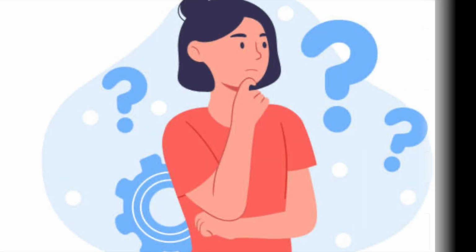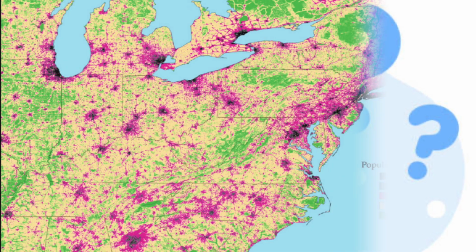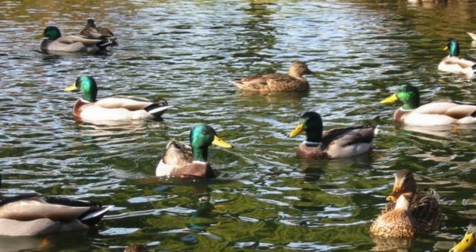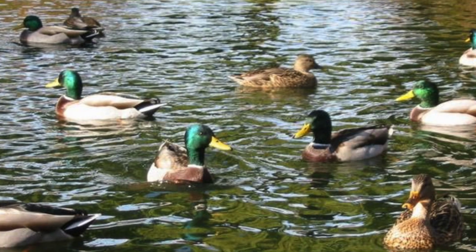The results were inconclusive. We theorized that bodies of water around populated areas tend to have more microplastics due to increased littering. Our sample size was also small, with 4 samples from different parts of Maryland. The stagnant water samples had the highest as well as the lowest number of microplastics, and the duck pond had such a higher number than the rest of the samples that it could have been an outlier.